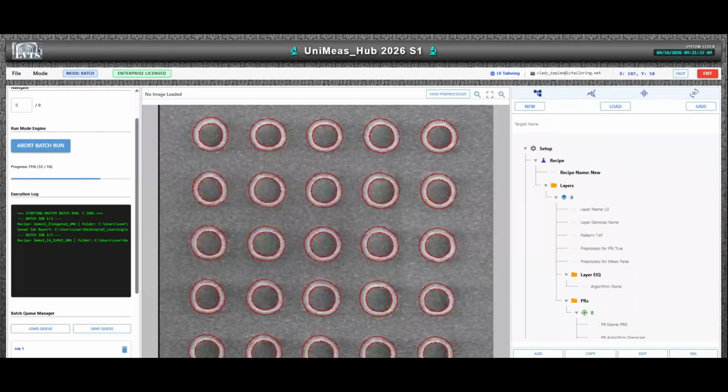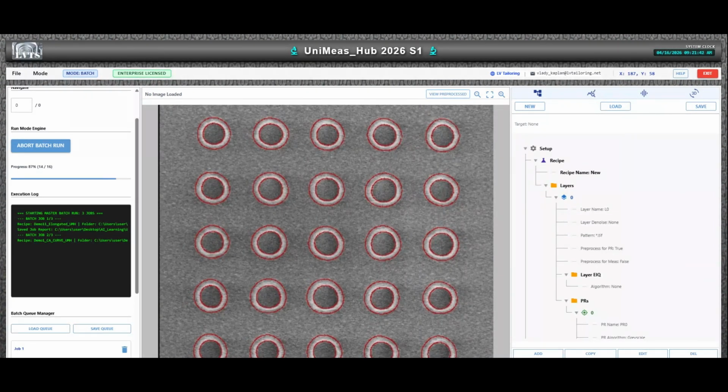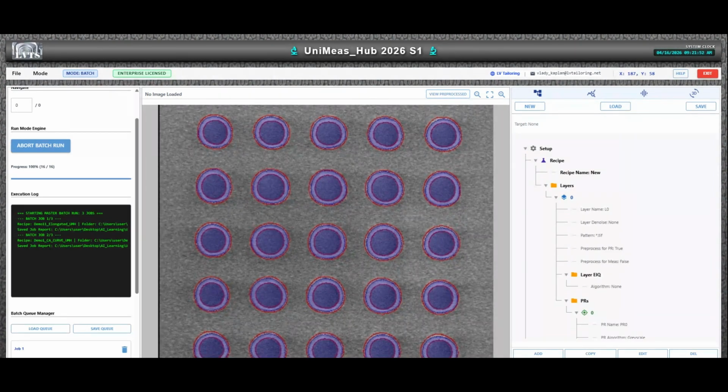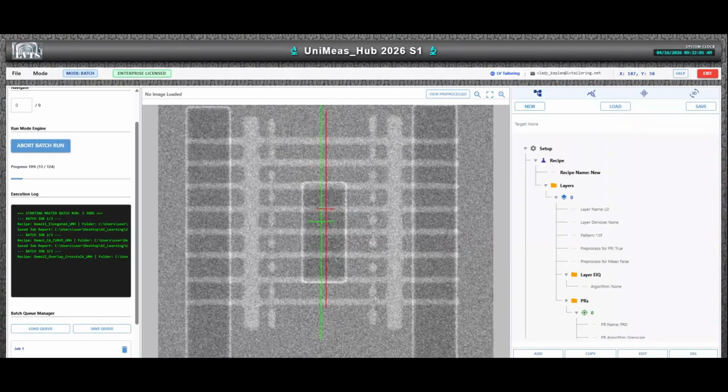As the engine completes its nested loops, it gathers the successful measurement arrays and compiles dozens of calculated metrics simultaneously for the whole dataset. Users can monitor this batch data instantly through the built-in graphics dashboard.